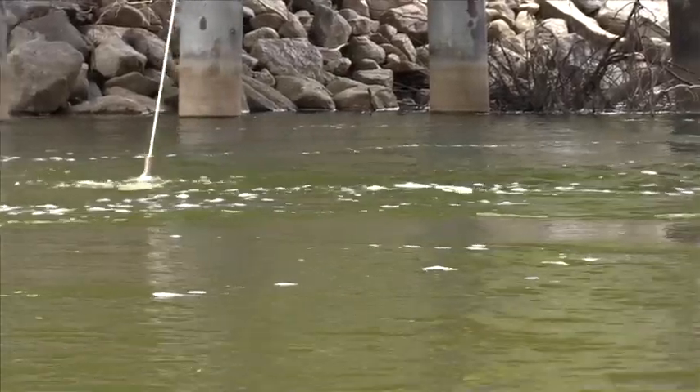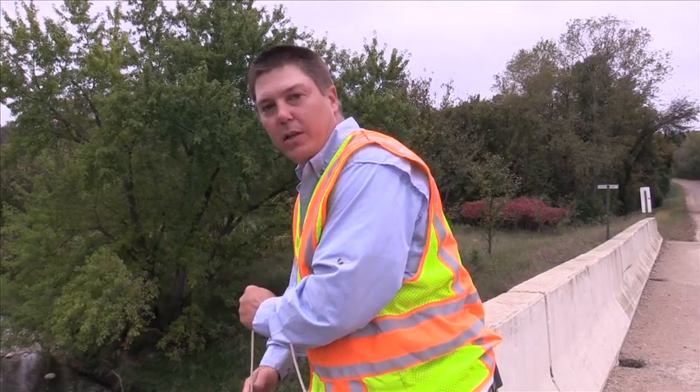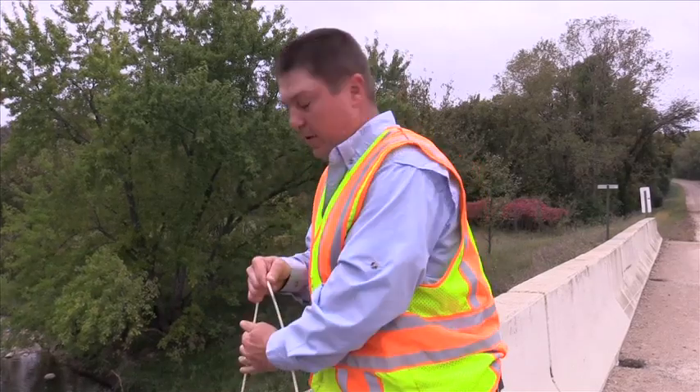It can be a little tricky to get your timing down just right, especially if you're in a stream that has pretty heavy flow and your sampler is swinging pretty fast.